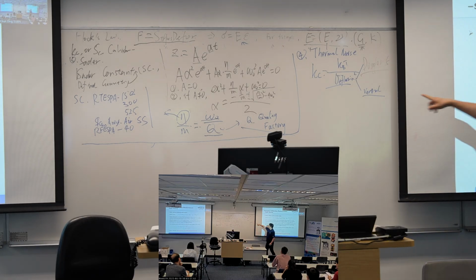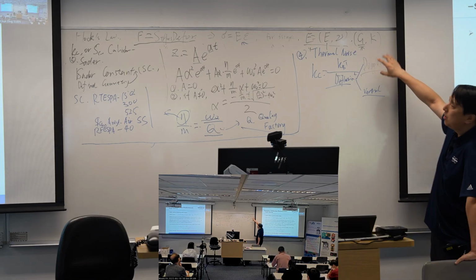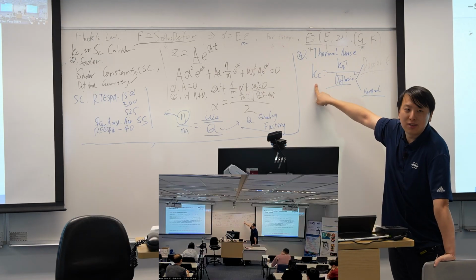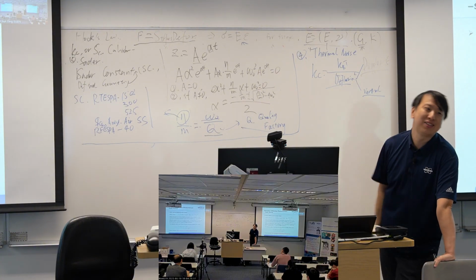So the probe manufacturers, before shipping to you, use Doppler effect instruments to measure the deflection, get the Kc out, and write down the Kc number. And then they sell the probe to you at a higher price.